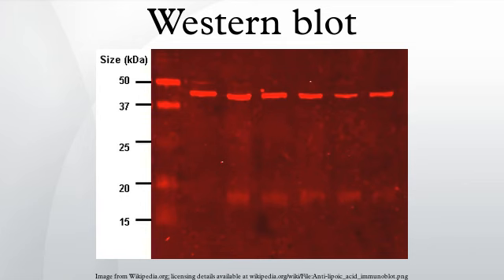Another method of secondary antibody detection utilizes a near-infrared fluorophore-linked antibody. Light produced from the excitation of a fluorescent dye is static, making fluorescent detection a more precise and accurate measure of the difference in signal produced by labeled antibodies bound to proteins on a Western blot. Proteins can be accurately quantified because the signal generated by the different amounts of proteins on the membranes is measured in a static state, as compared to chemiluminescence, in which light is measured in a dynamic state.